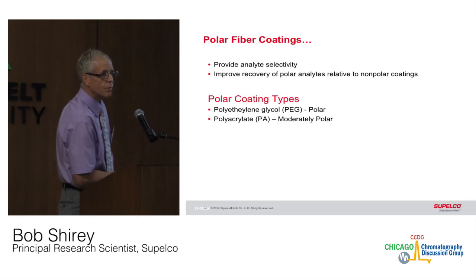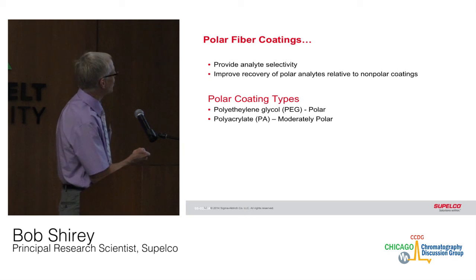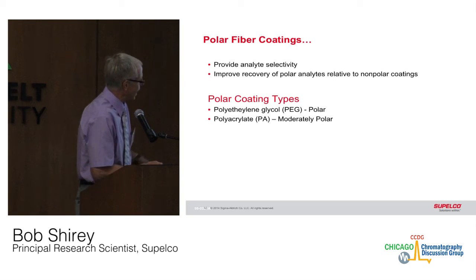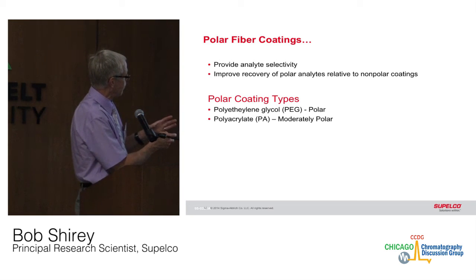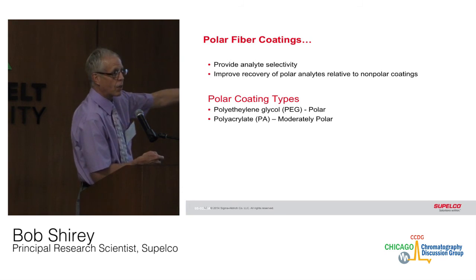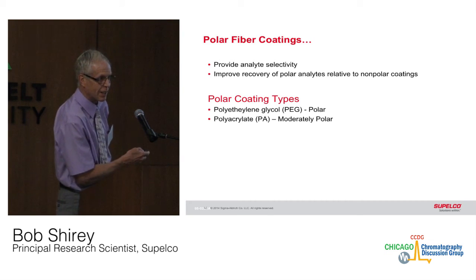How do you get high recoveries of 140%? That's sometimes, you know, I'm not really sure how. In many cases, this is relative to the chrysene response, so its response was higher than the chrysene for these. That's what it is. I should have said that at the beginning, I apologize.